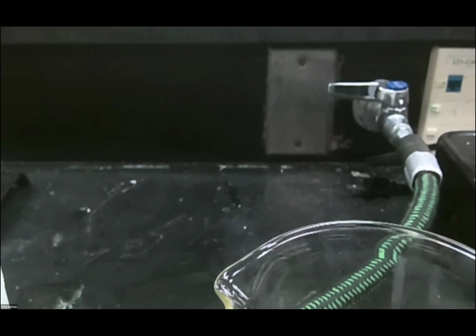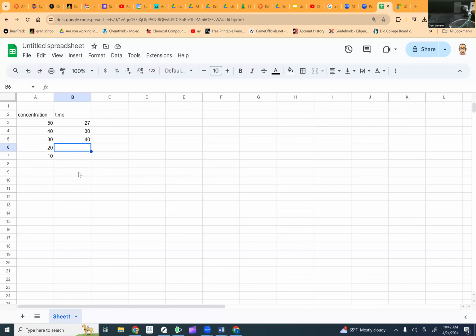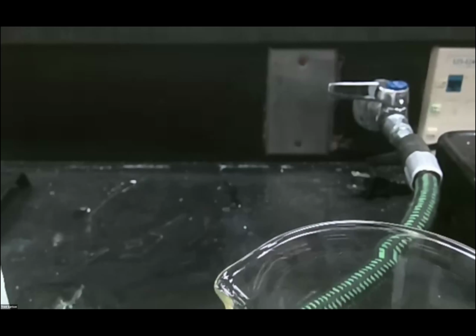All right, so let me share my screen and put that in at 68. We can't put it in as a minute 8 because the computer doesn't understand that because it's numbers. So we're going to put this in at 68. All right, I'm going to do one more experiment with this one. Since that took so long, I'm going to do a time elapsed on this one.